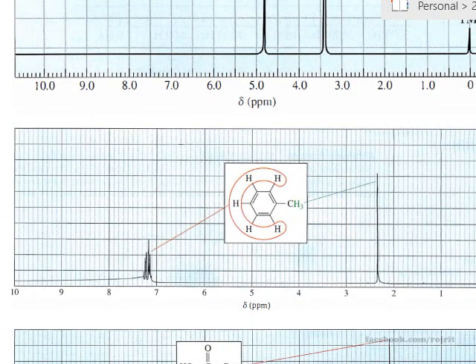This circulation of electrons creates a very strong internal magnet, and it synergistically emphasizes the magnetic moment that is interacting with the 5 hydrogen atoms in the red circle, and then your hydrogen atoms feel a stronger magnetic moment than usual, and they appear far left at about 7 ppm.